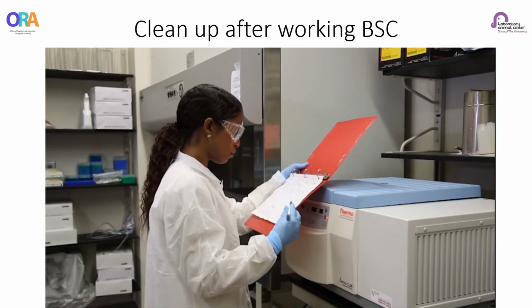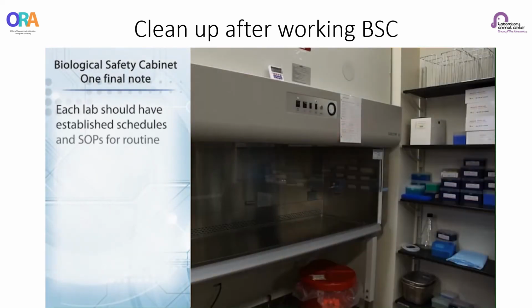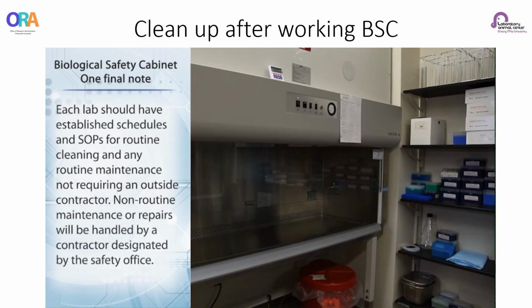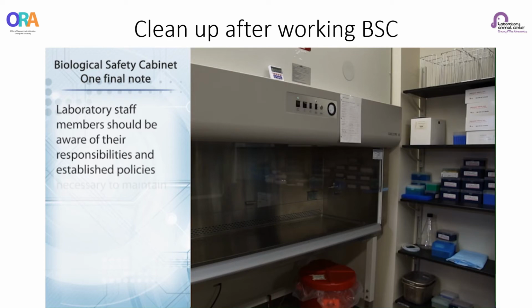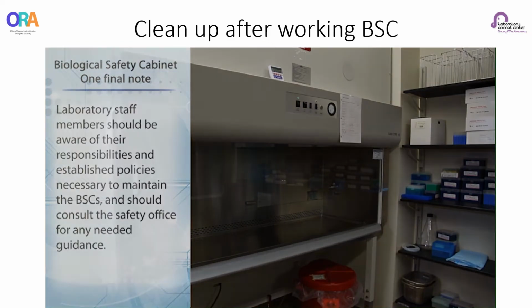One final note. Each lab should have established schedules and SOPs for routine cleaning and any routine maintenance not requiring an outside contractor. Non-routine maintenance or repairs will be handled by a contractor designated by the Safety Office. Laboratory staff members should be aware of their responsibilities and establish policies necessary to maintain the BSCs, and they should consult the Safety Office for any needed guidance.